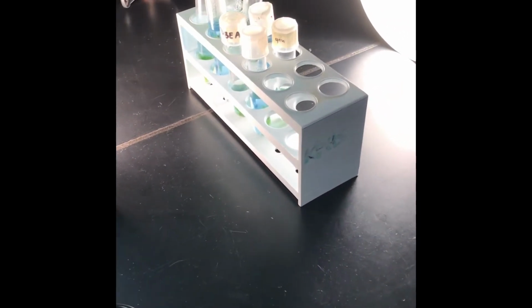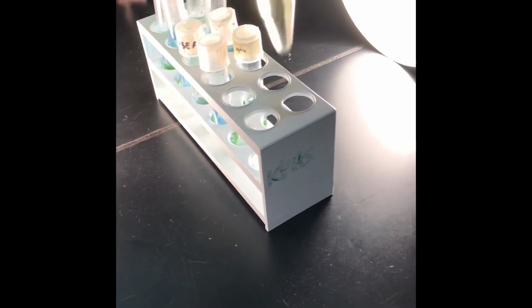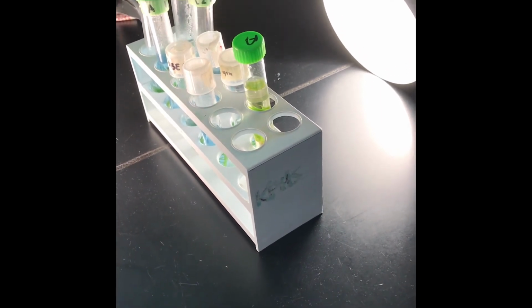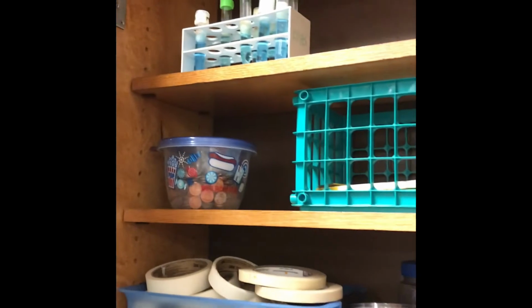Okay, so this is where we're putting your test tube A. You can see your other classmates are already in there. So we're going to put this in front of the light, and we're going to come back and check data every day. Here we go. All right, test tube B is going in the cabinet. You can see everybody's are up here. So here it is. We're going to take it, put it in the cabinet with everybody else's.